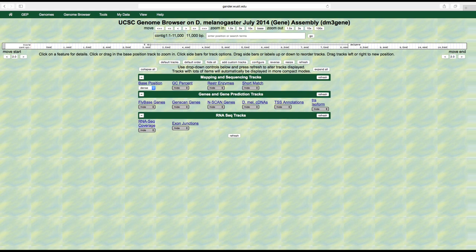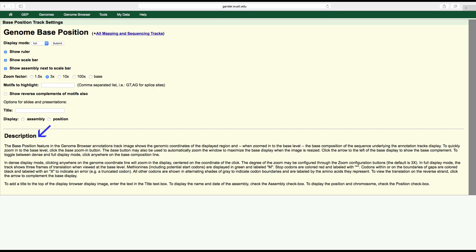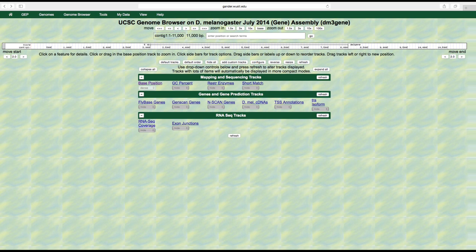Let's look at a few features. Start by clicking on the base position link under mapping and sequencing tracks. By clicking on this we can view a description of this particular track and change its settings if we wish. As the description states, the base position feature in the genome browser annotations track image shows the genomic coordinates of the displayed region, and when zoomed into the base level you can see the nucleotides within that region. The description also tells us more about how to view the individual bases.